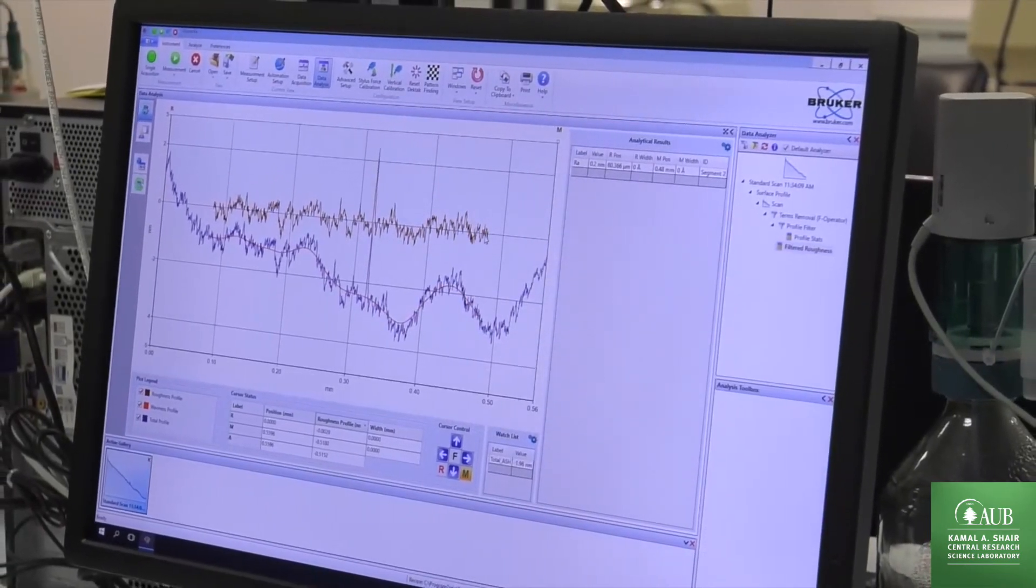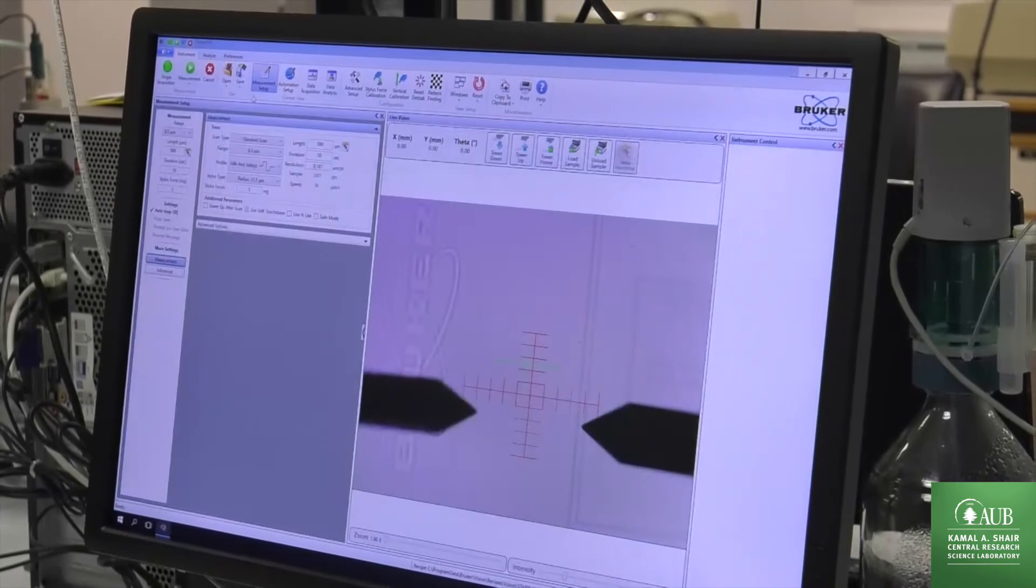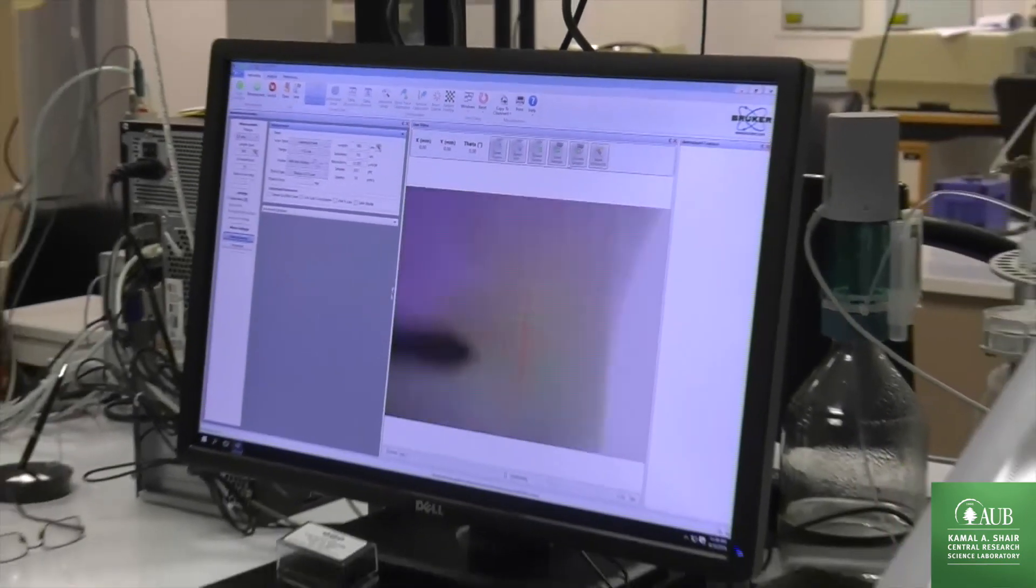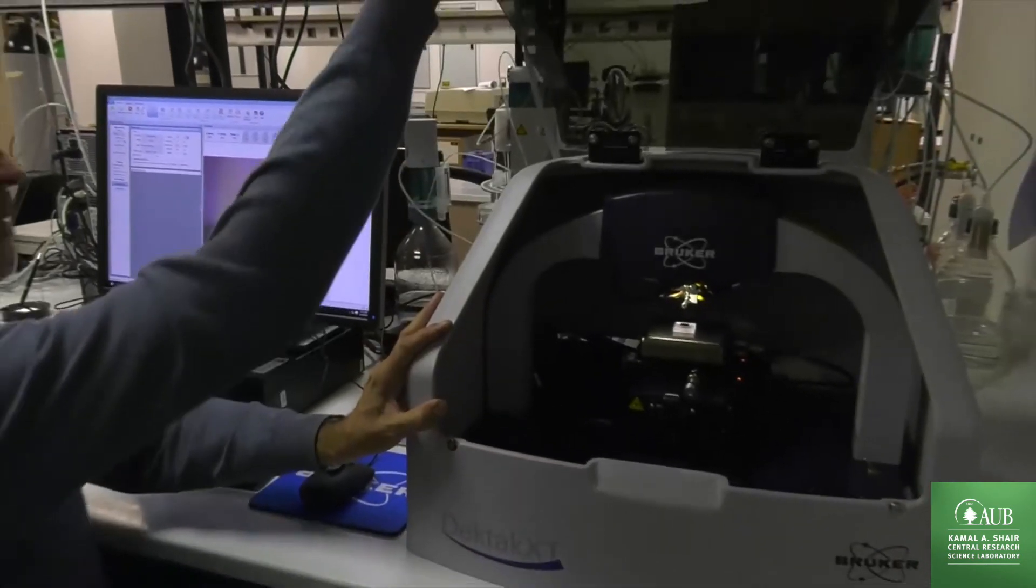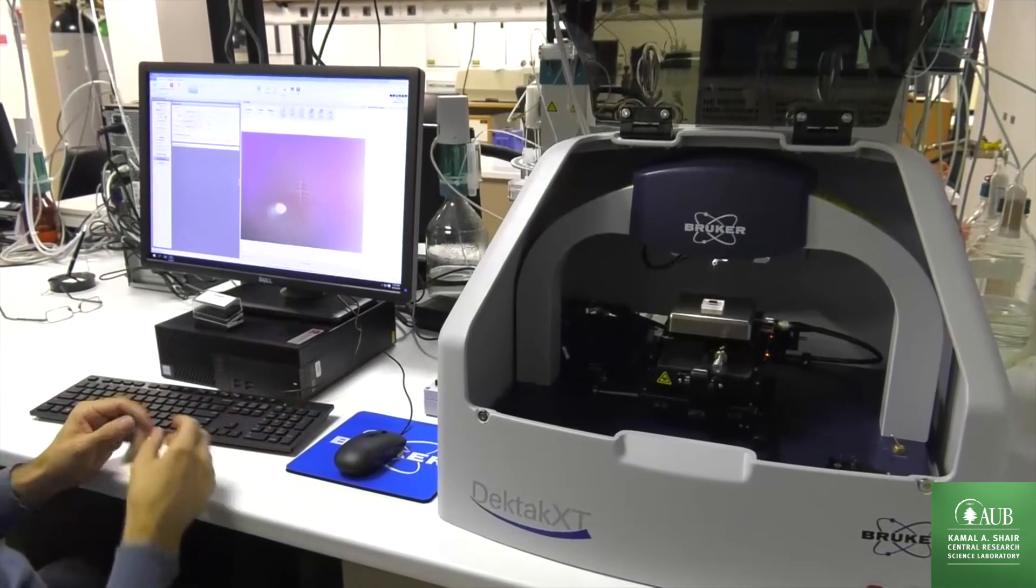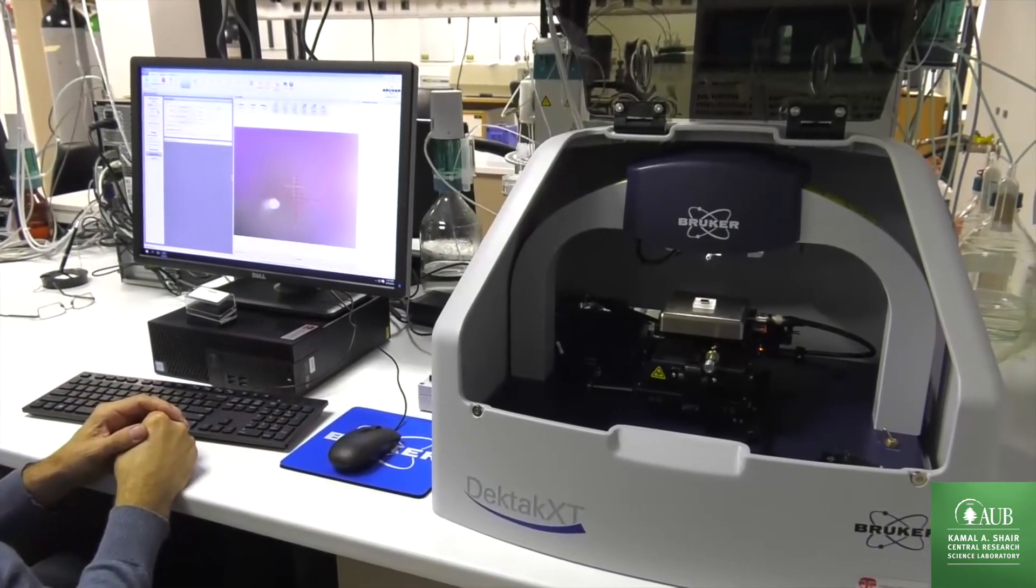How to remove the sample when I am done with all the measurements. Go back to measurement, click on unload sample, and automatically the tower will move to the top position, and the scanner will move towards the user, so I can remove the sample.